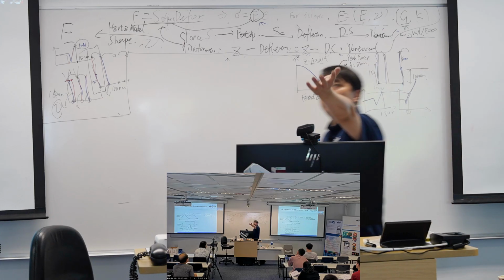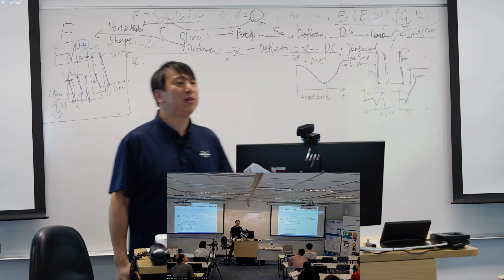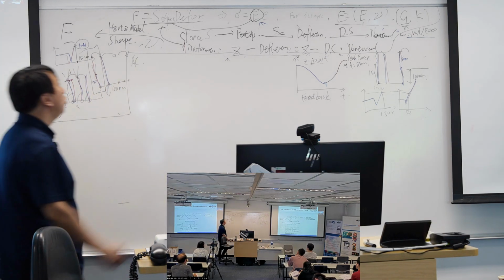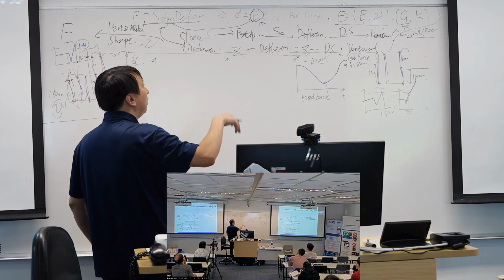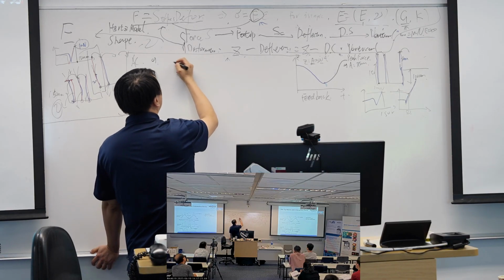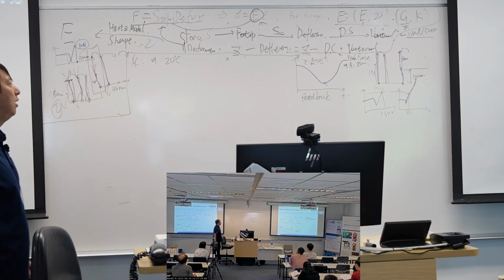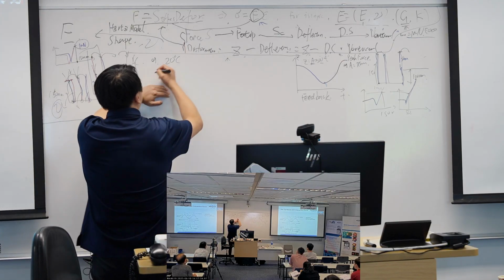For example, your air conditioner is just using a feedback concept. You set this room temperature. You give a set point of the temperature. For example, you want 20 degrees C, and then we have a sensor.